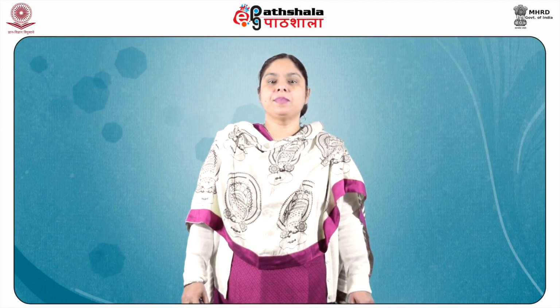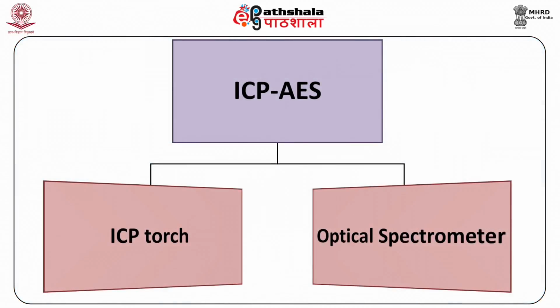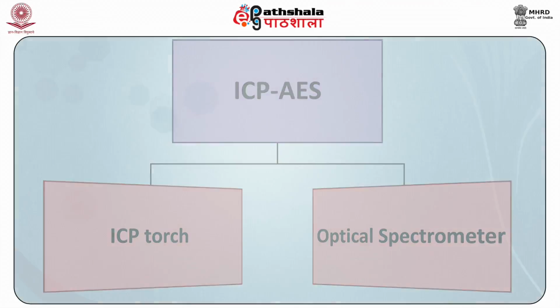Now, this is the most common technique for elemental analysis with which almost all the dissolvable samples can be analyzed properly. This method is actually suitable for dissolved glasses and is a very rapid and a very precise method. Now, it actually consists of two parts. One is the ICP torch and the second is the optical spectrometer.